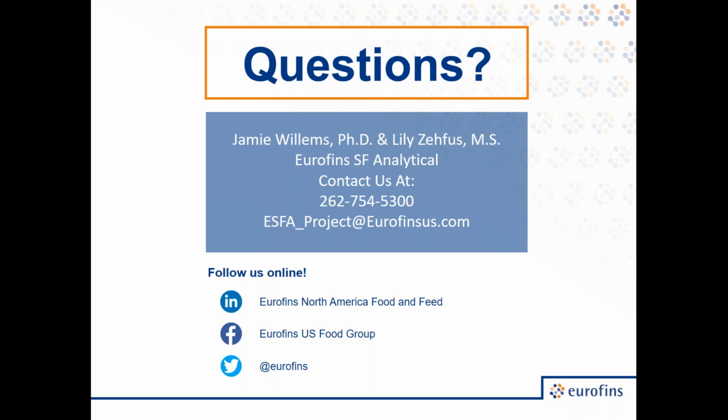Thank you. Our next question here is, in the event that microbiological degradation is the cause of off-odor, off-flavor in food, can you identify the offending microorganism or narrow down the classification of microorganism that is causing the problem? Sure. So in some cases, it is possible to isolate microorganisms that may be causing the off flavors and off odors. Typically, we would culture both the control and the suspect on a variety of media with various conditions.